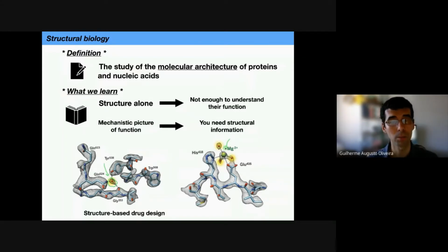So think about the potential we have with cryo-EM, for example, for structure-based drug design. Right now, in a cryo-EM lab, it's pretty easy to have several structures in a week or in a month. Imagine you can try to form complexes of a specific target with different molecular hits. So it's a very exciting time to think about these applications in the drug design field.